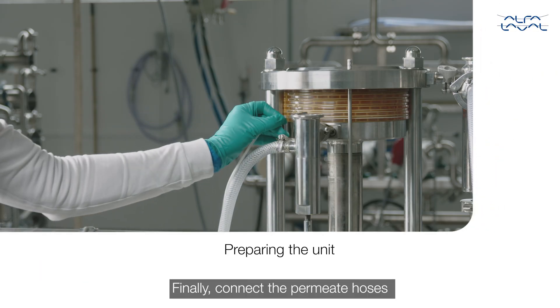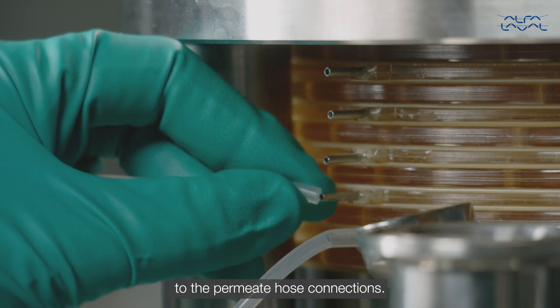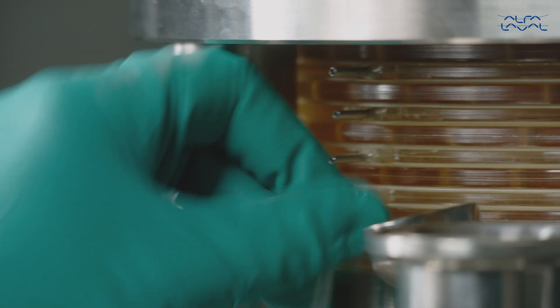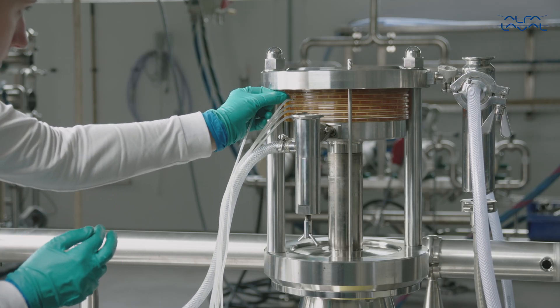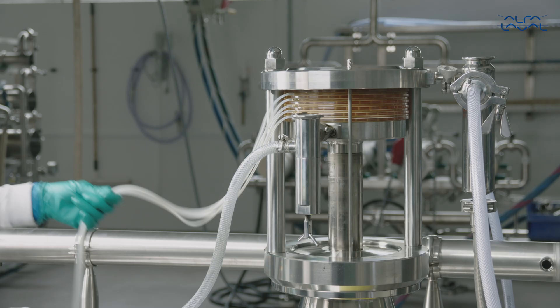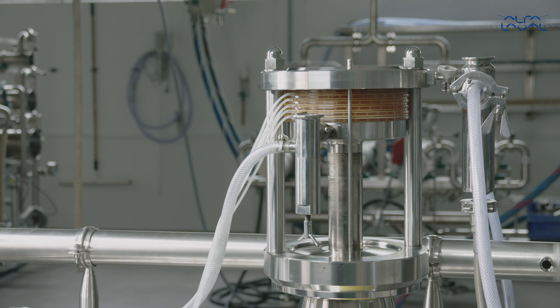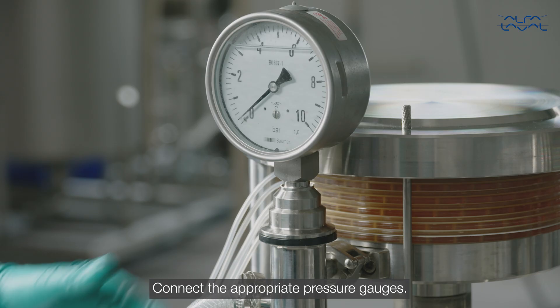Finally, connect the permeate hoses to the permeate hose connections. Connect the appropriate pressure gauges.